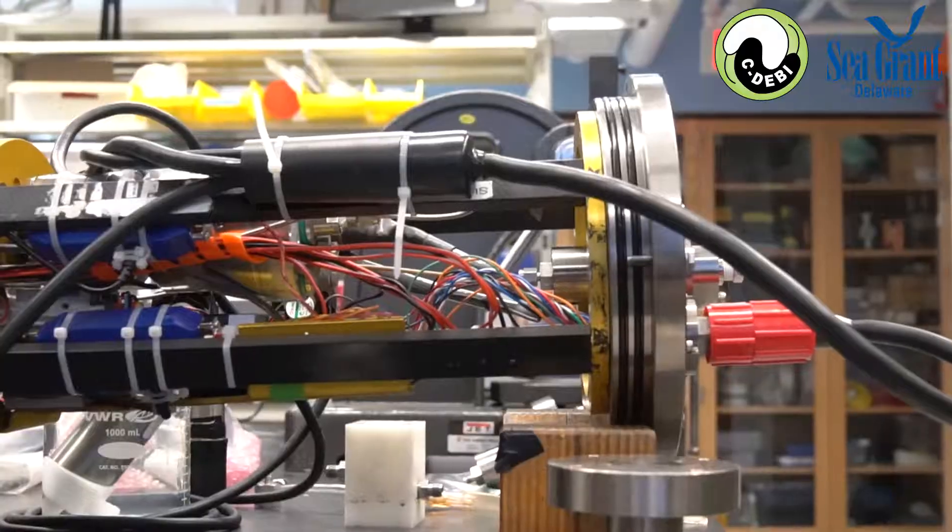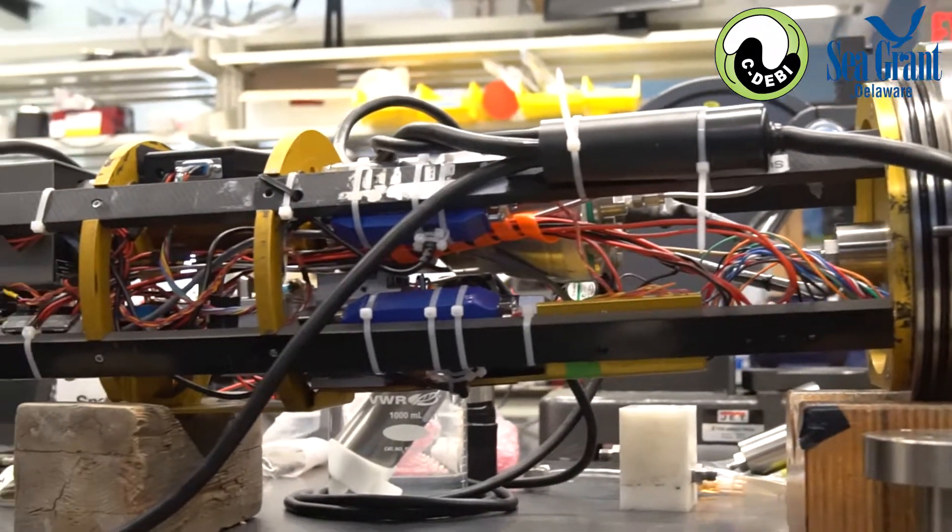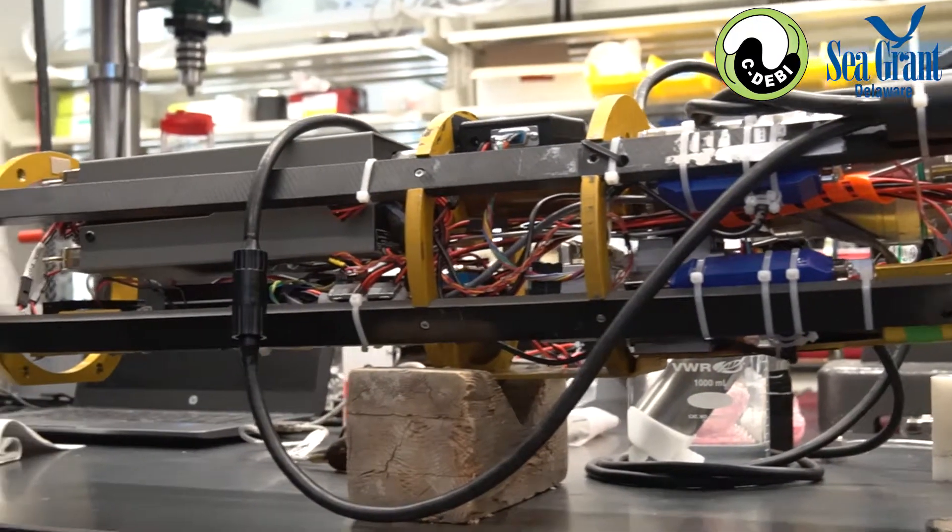My name is Dan Herr. I'm a postdoc in the Girguis lab at Harvard University. What I'm going to talk to you about today is the underwater mass spectrometer. What it is is a way for us to measure the concentration of gases on the seafloor.